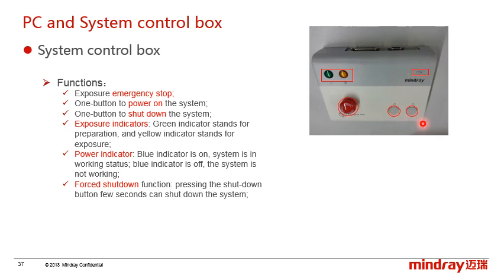And the force shutdown function: you can press the shutdown button for a few seconds, and the whole system will be shut down in a short time.